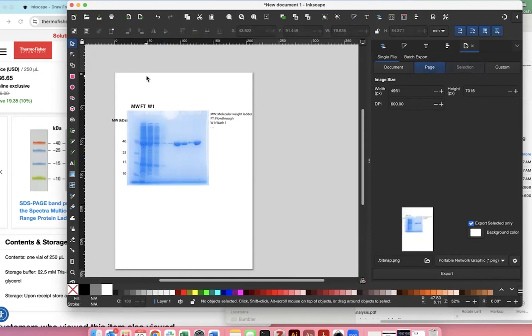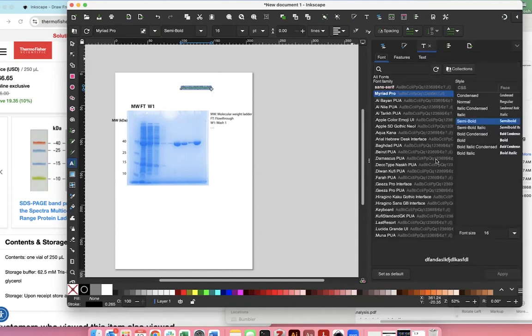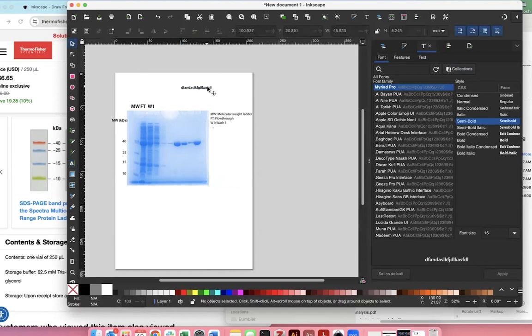If you want to have text, just press T or come over here to this tool. Let me give my text, and I can write whatever I want. Because I have those settings for the rectangle, it's going to give me this weird text with style that I don't really want. So what I'm going to do is go to text, and I'm just going to fill it with black. Stroke, I want to stroke it with nothing. And so I just shift click again. And now I'm back to the settings that I want.